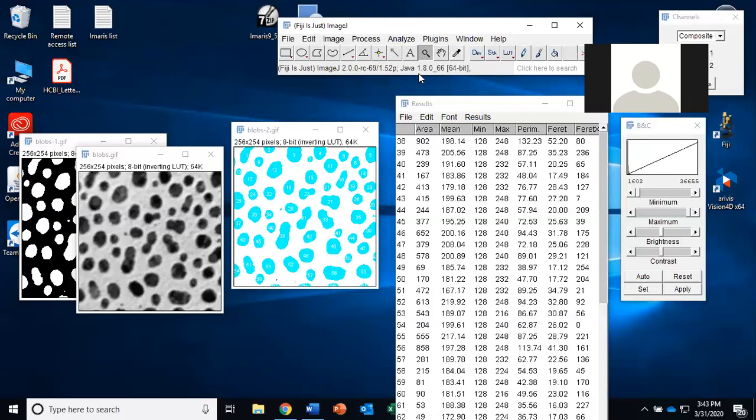Yeah, I mean, it depends a bit on your data and what you're wanting to get out of it. If it was a wide field measurement, I wouldn't see any reason to do it in 3D. I'd just pick a good 2D plane. If you're working in 3D, it gets a little bit different. With co-localization, there's kind of 2 big methods.